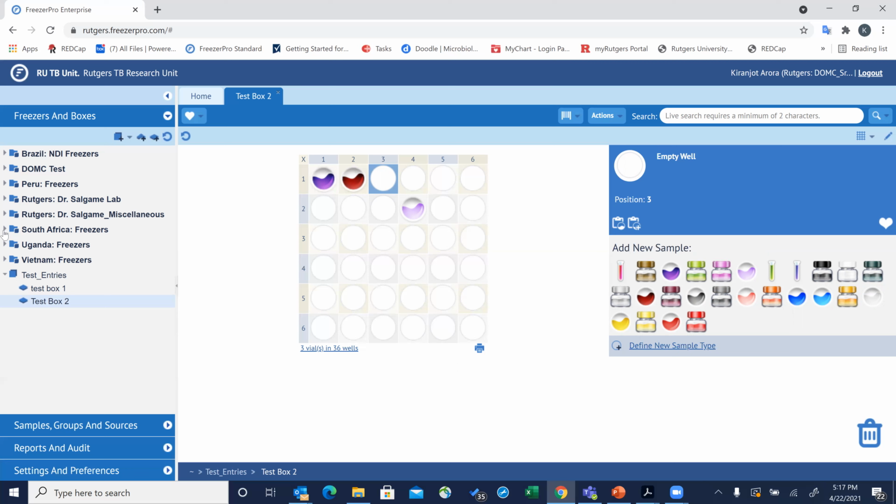So you'll have pre-printed labels that you'll apply to the tubes, and then you will write in the source document the barcode, or if you have already printed the labels for barcodes, you'll put that in the source document, and then scan and move the samples from the printed label station to the actual freezer. All right, so we covered that.